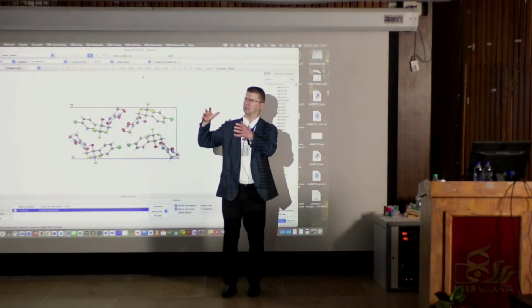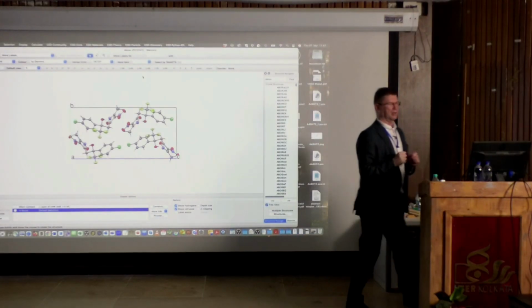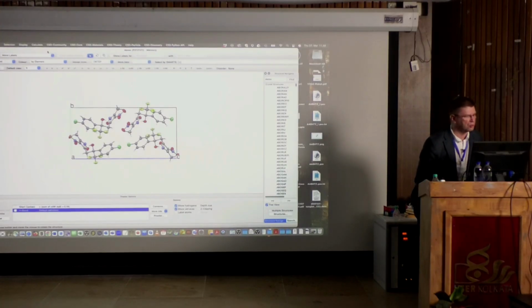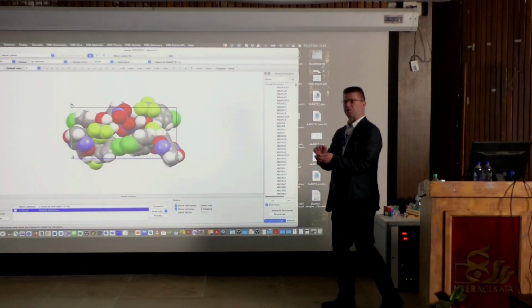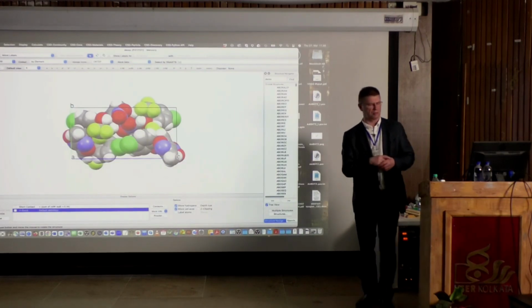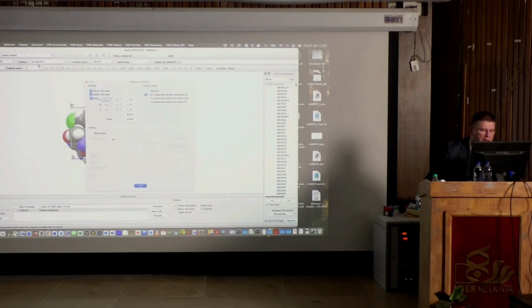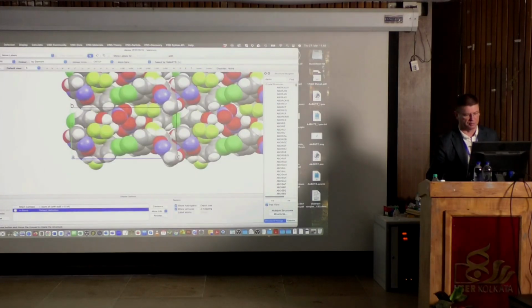So can it be so that the atoms are floating in there? That is not actually true, and that's why it's always better to look at these things in a space filling view. And now you can see there is no empty space. So it's completely full. And to show it even better, that will be the last one we will move. I will go here and ask it for a packing, but now I will ask it to calculate a bigger area.